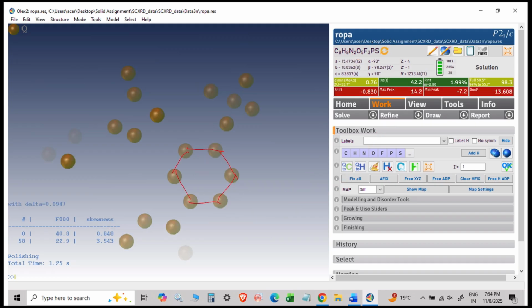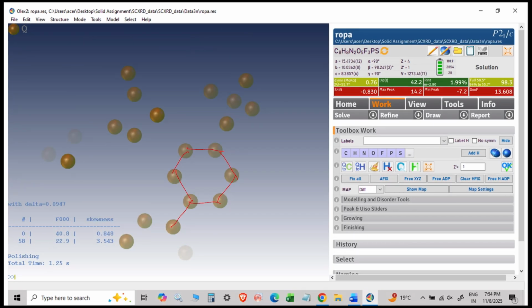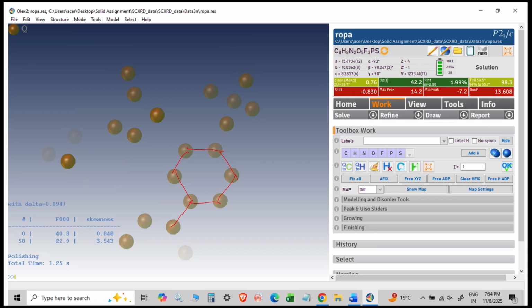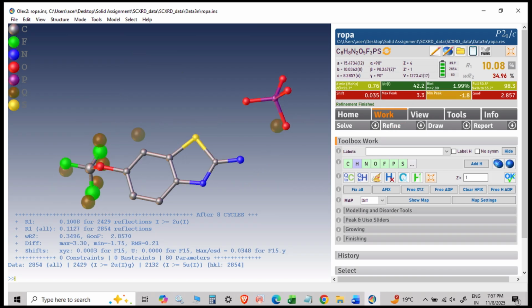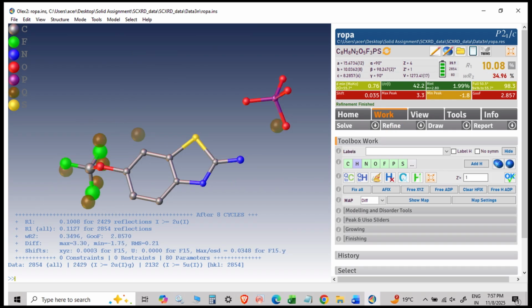So I'm starting with this only. Then, as you can see, there's this particular oxygen atom here. Then if I refined it again, I found that there's a carbon atom. This CF3 moiety is still there, and again, this R value is so high. Again, the riluzole moiety is still formed after refining it and assigning, by the hit and trial method. Then the most difficult part was whether it's a phosphate or hydrophosphate, dihydrogen phosphate, orthophosphate, whatever it is.